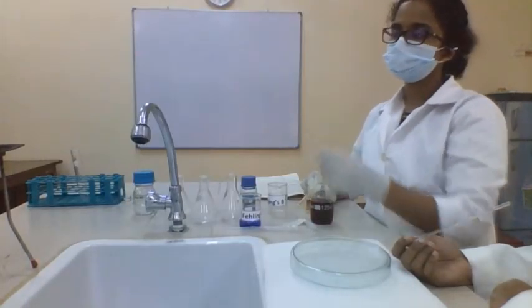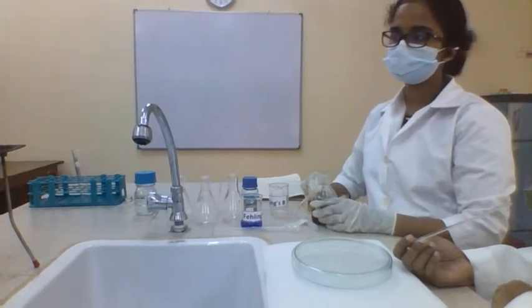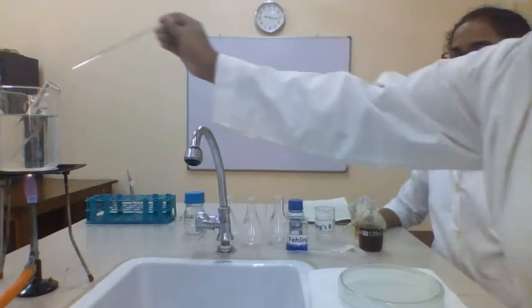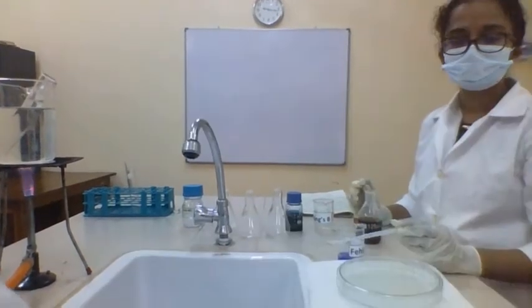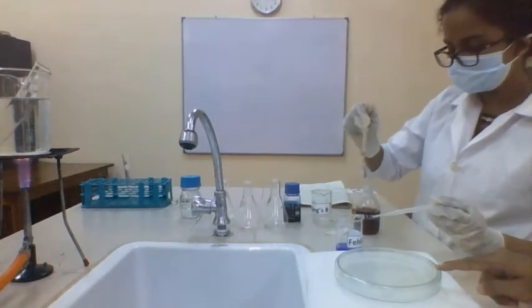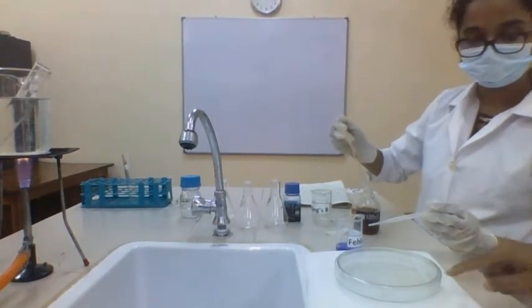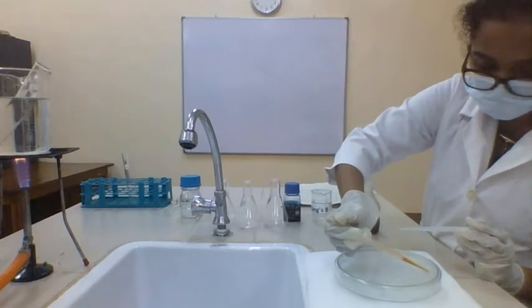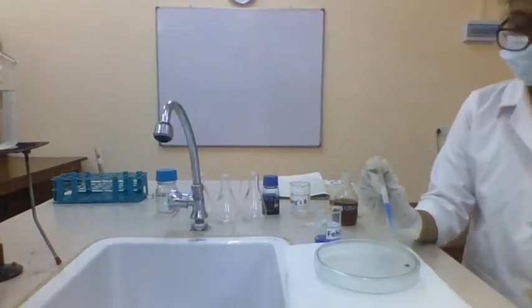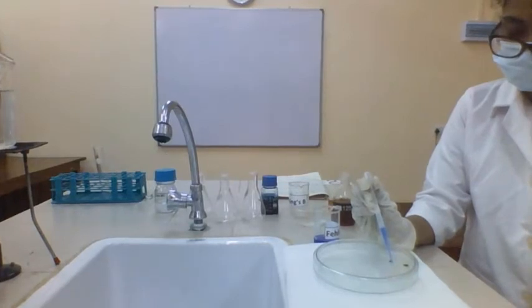Now we are going to test a few drops from the solution in the water bath. Then we are going to take a drop and add iodine, and likewise we are going to add Fehling's to another drop. Then observe the color change.